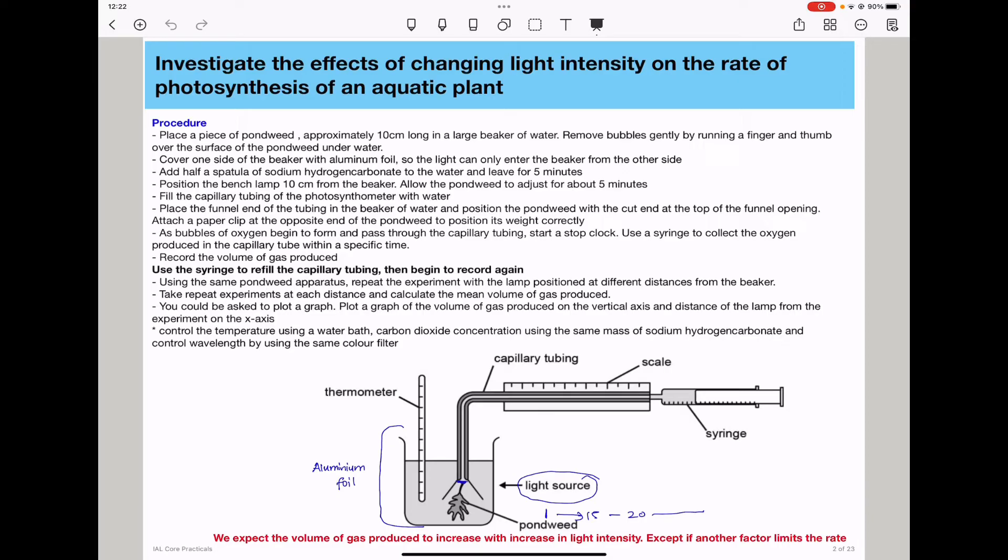So using the same pondweed apparatus, you will need to repeat the experiment with the lamp positioned at different distances from the beaker. Remember, varying the position of the lamp is the same as varying light intensity because if you bring it closer to the experimental setup, it means there is high light intensity and if you move it far away, the light intensity is decreasing. So the higher the light intensity, the higher the rate of oxygen being produced and therefore the higher the rate of reaction. That should be your expected result.